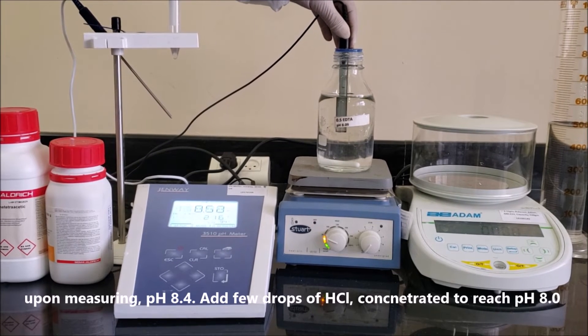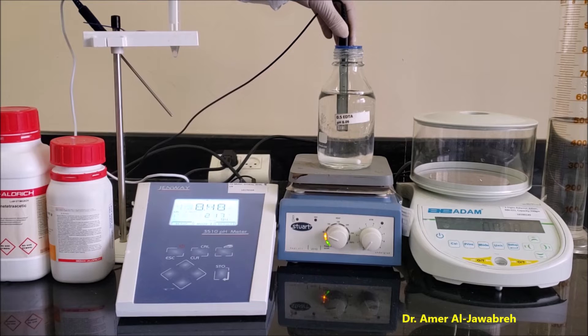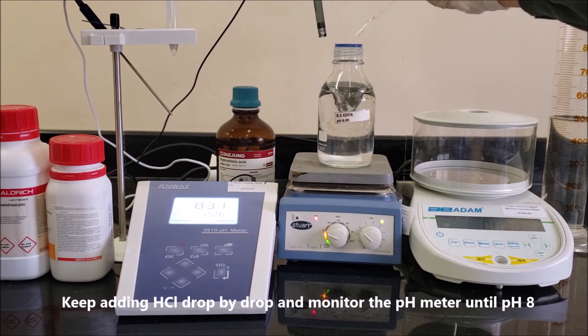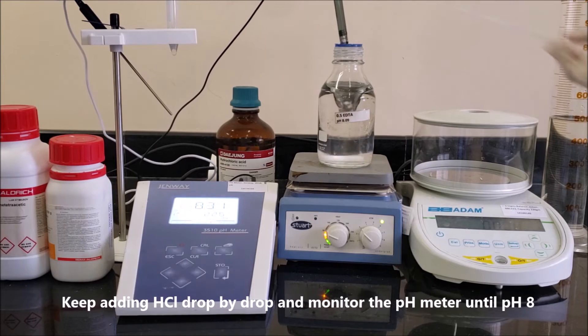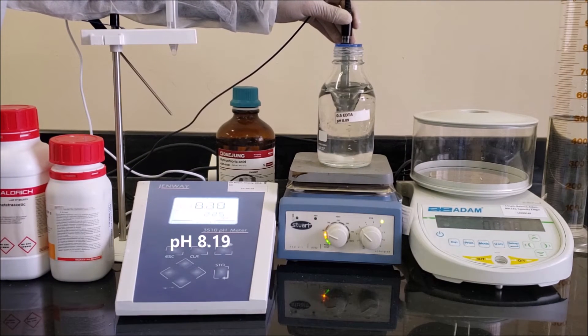Upon measuring a pH of 8.4, add a few drops of concentrated HCl to bring the pH down to 8. Keep adding HCl drop by drop and monitor the pH meter until pH 8 is reached.